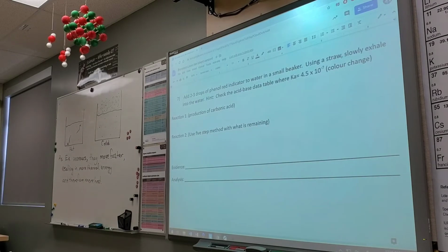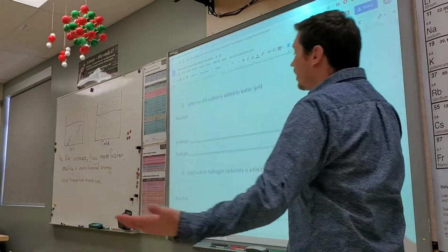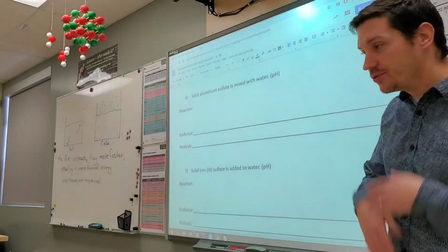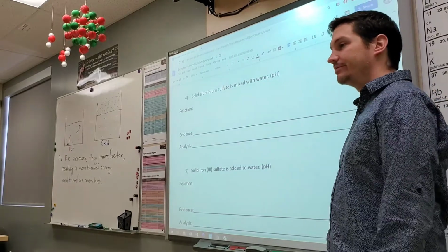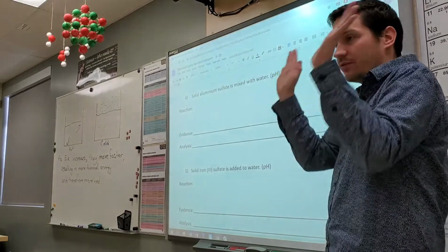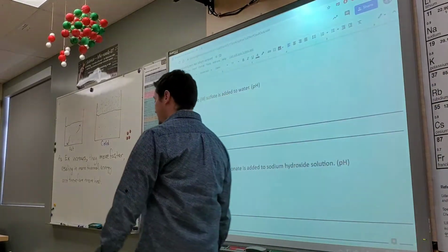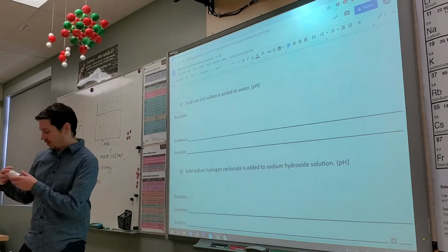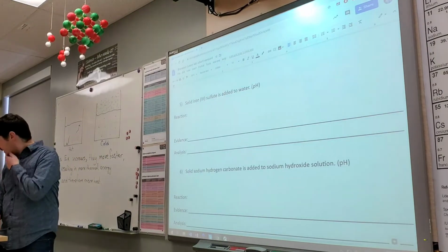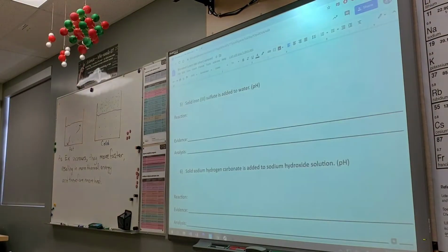Okay, can we all, somebody pick a number 1 through 6. 5. Well, let's take 5 for right now. So let's add some iron. Yeah, that's what I have here, so that's good. Let's add some iron-3 sulfate to water and see what's going to happen.